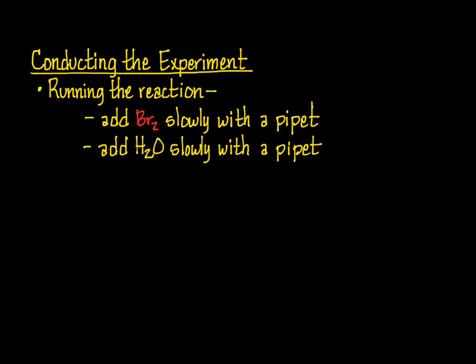After all the bromine's added, you may end up with anywhere from a deep red to a light yellow mixture, depending upon which compound you started with. One of the compounds reacts with nearly all the added bromine, resulting in a light-colored reaction mixture, because there's very little red bromine left over. But another of the compounds only reacts with one equivalent of bromine added, and this leaves over 2 equivalents of molecular bromine in the mixture, and thus a deep red color.